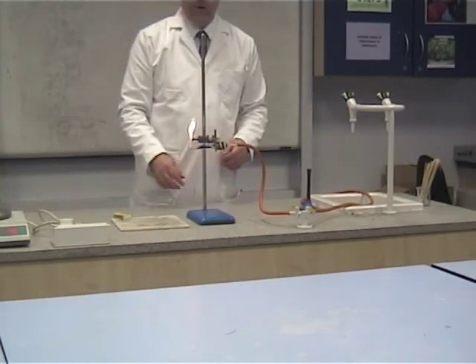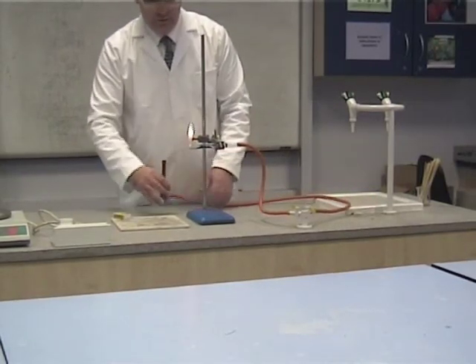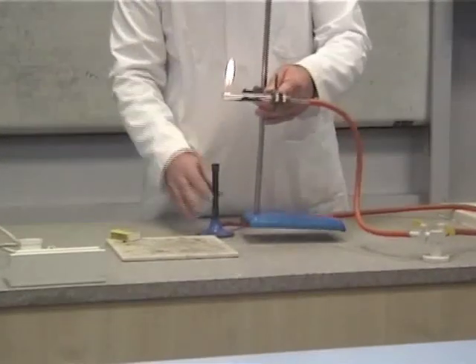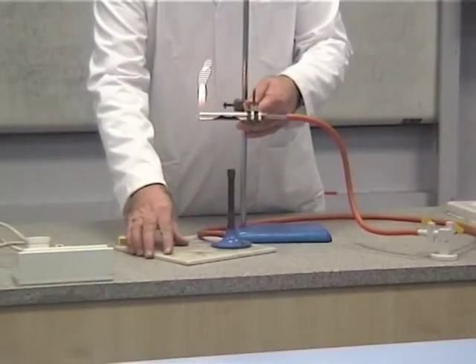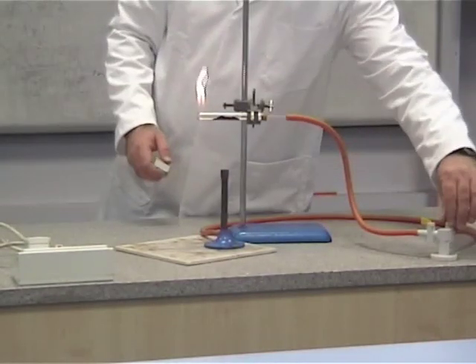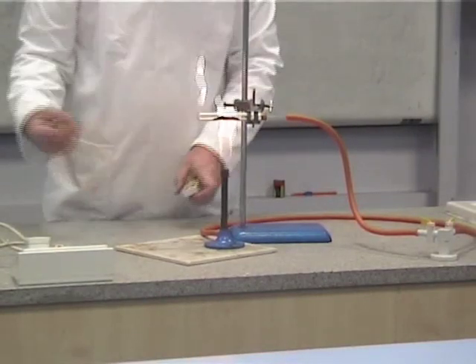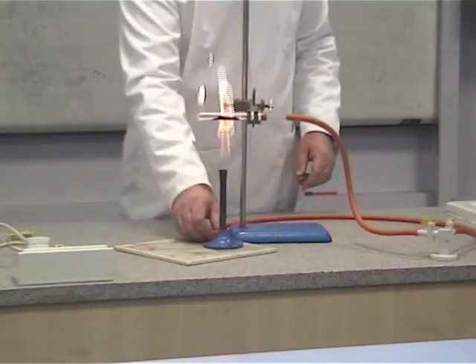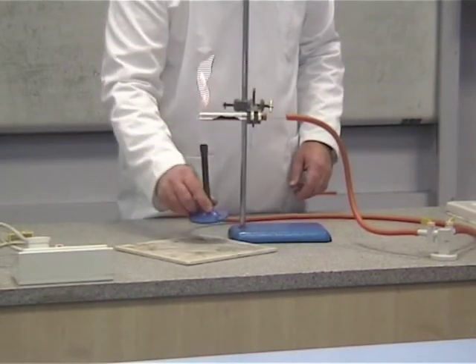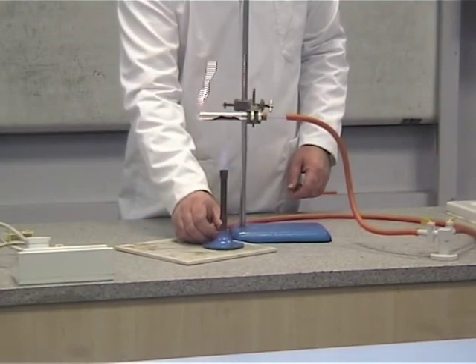Next thing we need to do once that is going is to heat the copper oxide in the tube. We need a second Bunsen, so you need to make sure your gas taps are all working nicely. Then let's just set that up like so. It is quite common at this point that students will, when they put the air hole on, manage to extinguish the flame like so. It is possible just to quickly, as long as you haven't turned the gas off, reignite it quite easily.